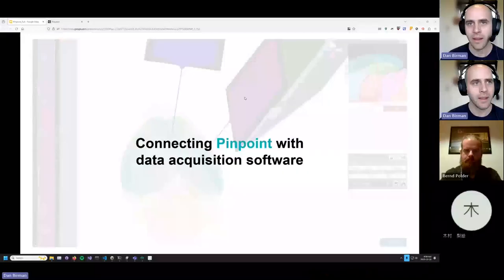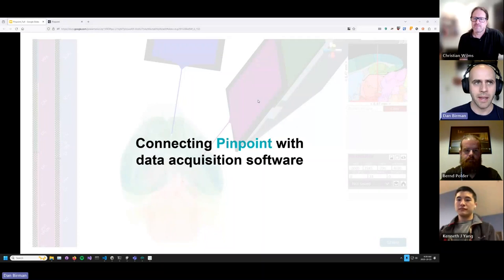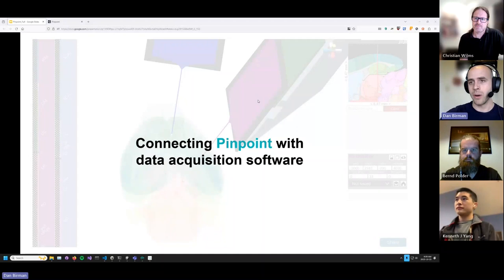Let me close out with the other side of connecting to hardware and software. You've now seen how to connect Pinpoint with hardware. The other end of this is connecting with your data acquisition software and forwarding where you are in the brain so you can see it side by side with your electrophysiology data.